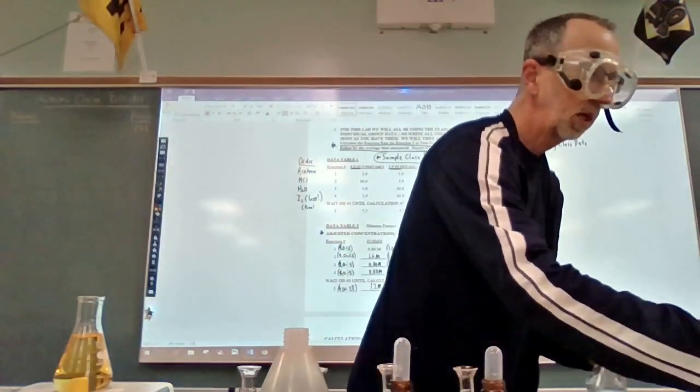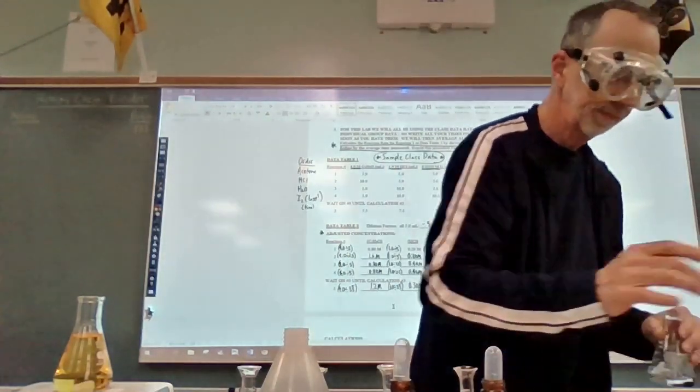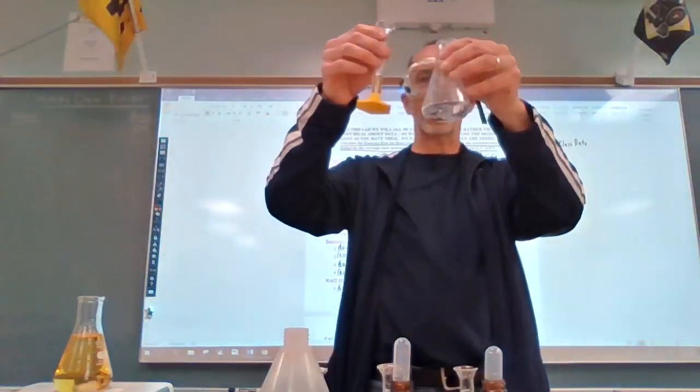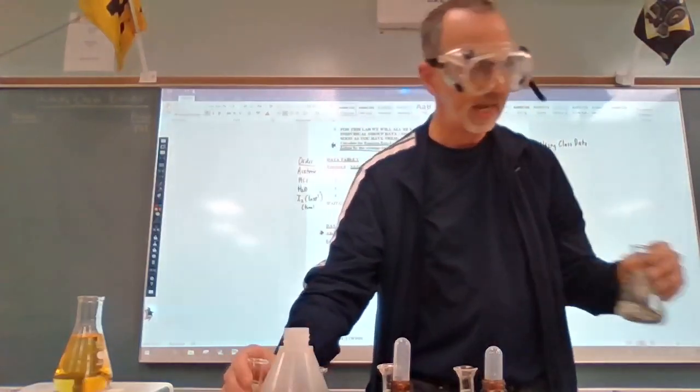Get the phone ready here. There we go. Clear. All right. Here we go. Going to add the iodine. Start the clock. Again, mine's a little delayed.